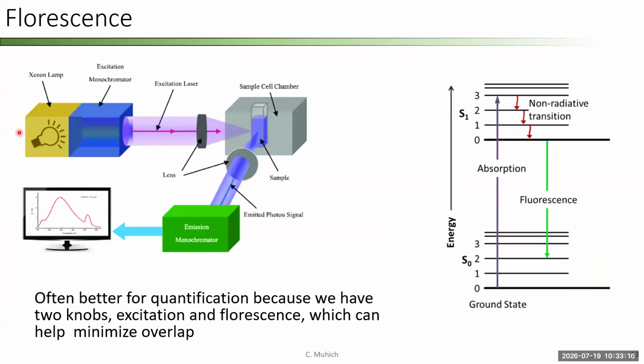A similar concept is fluorescence. Here, we take light, we shine it through our cuvette, but this time, instead of measuring what passes through, we measure what's emitted.